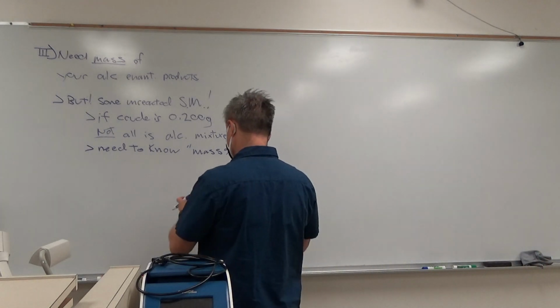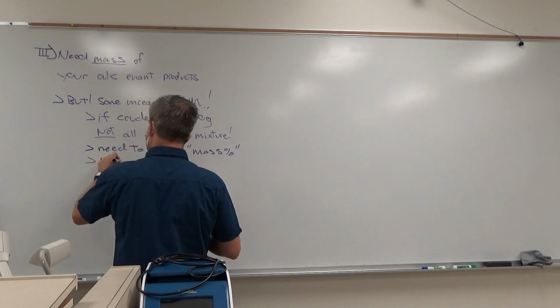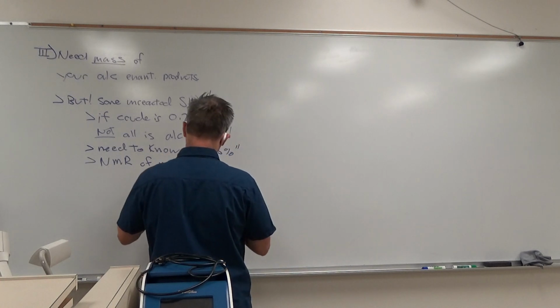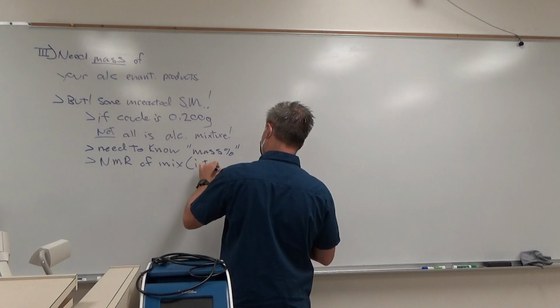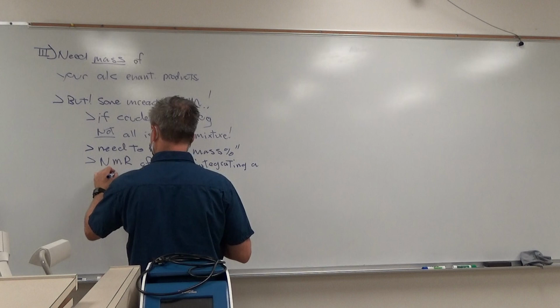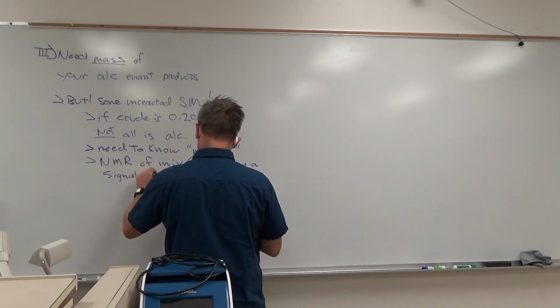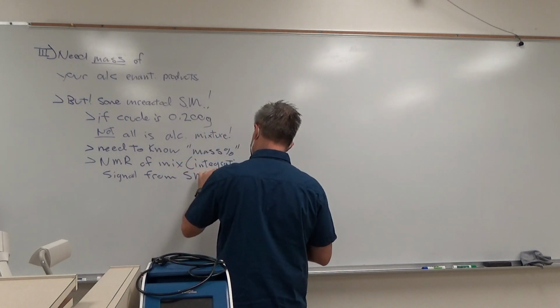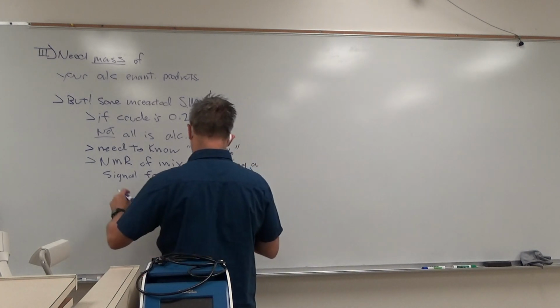Need to know the mass percent. NMR of mix, by that I mean integrating a signal from starting material versus product. Okay.